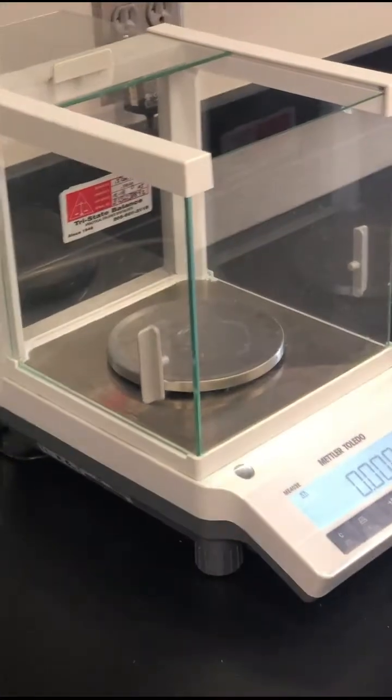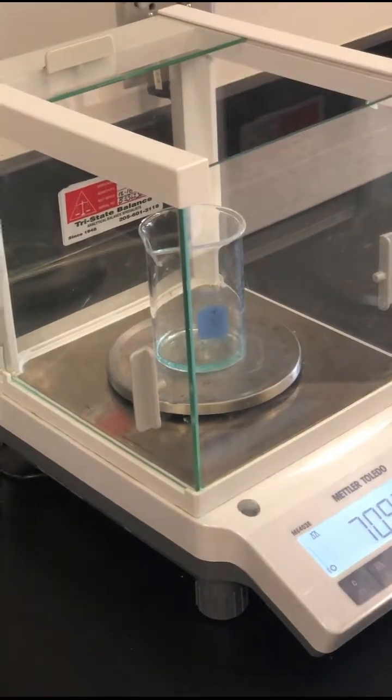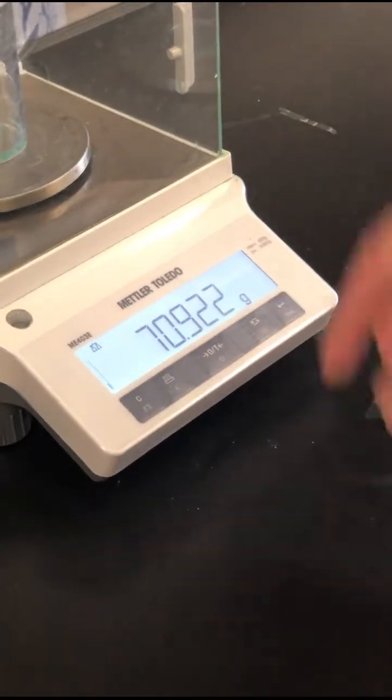to measure this. So we already measured the beaker once, and now we're going to weigh it, and we're going to get the difference. So we have 70.922 grams. And we'll subtract final minus initial to get the difference.